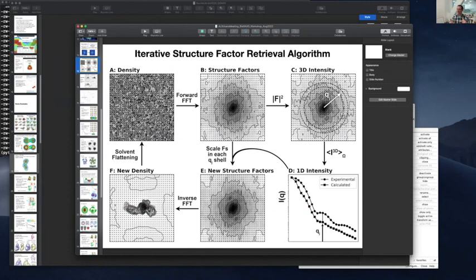So if you want to compensate for that, then you need to increase the number of samples, which by default is 64. So then you would set it to be 128. And then it would take, it's not quite 8 times as long, but it's quite a bit longer because Fourier transforms are like n log n or something like that. But it's at least 4 times as long, something like that. I feel like I'm way over my time here.